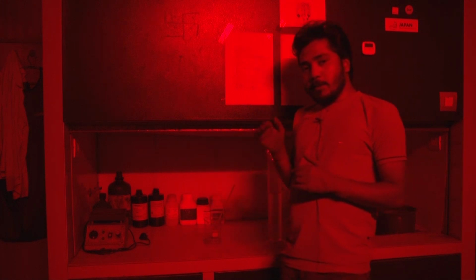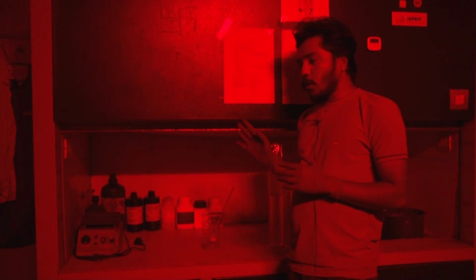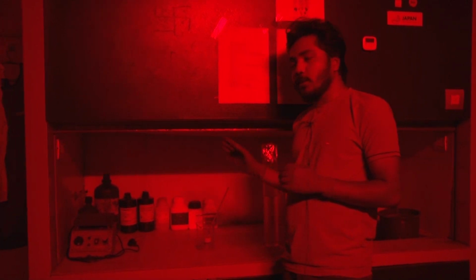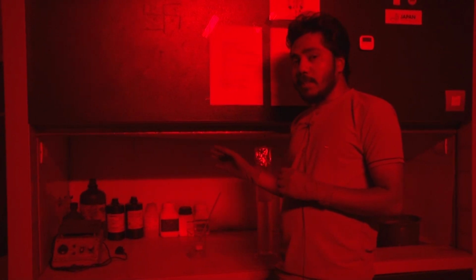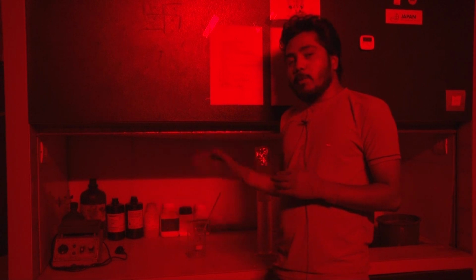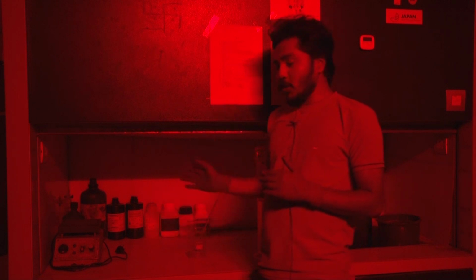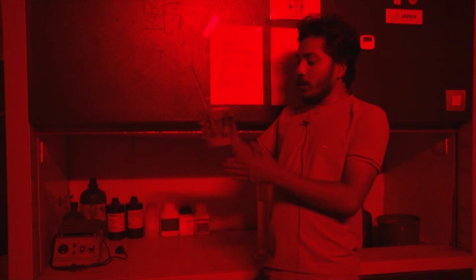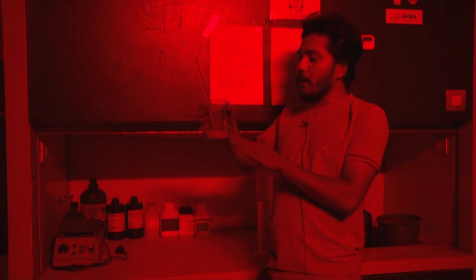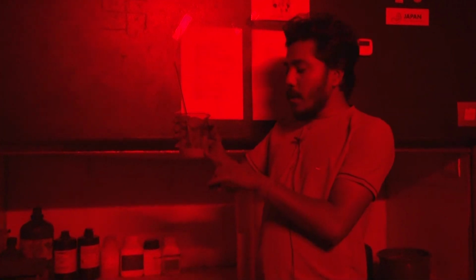As I was discussing the chemical processing part, here you can see this is the fume hood. All the chemical work we have to do in the fume hood, because we are using concentrated chemicals, and all the chemicals are dangerous, so we have to use them carefully. First you have to switch on the exhaust fan. Here you can see I have prepared one dummy sample. After opening and taking the center part of your pipe, you have to pour your sample into a beaker. This is the sample, and we will treat it first with the HCl.